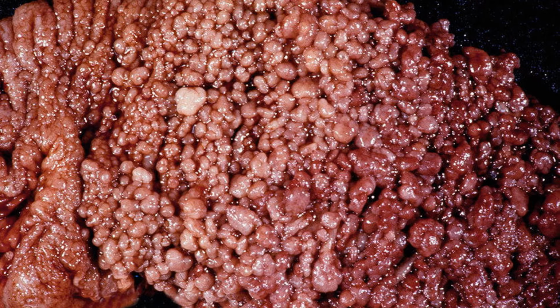Next is polyposis coli. This is the surface of a colon, right? But basically you don't see any haustration anymore. It consists of multiple, it's not even multiple, it's more than 100 polyps on the surface of the mucosa.